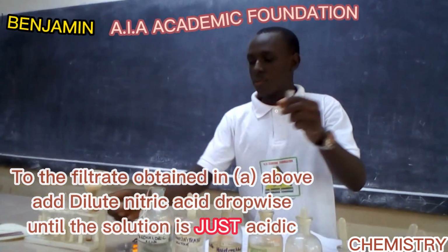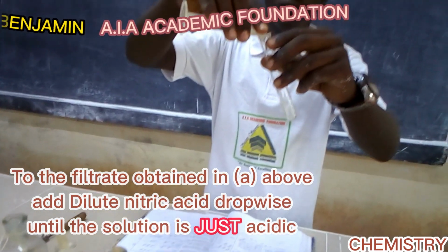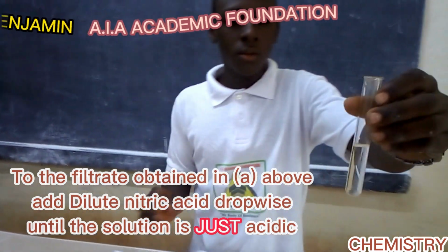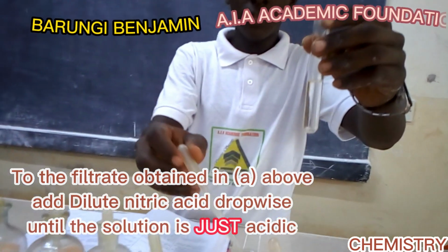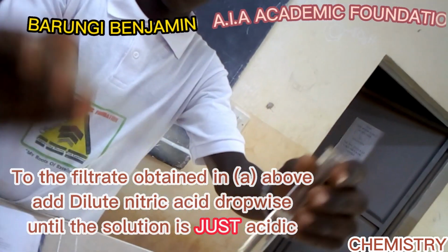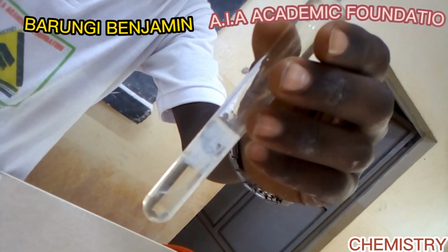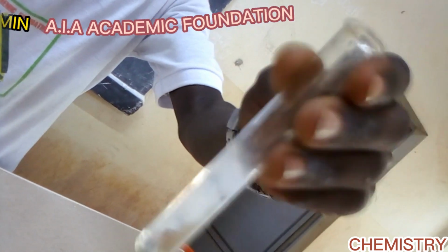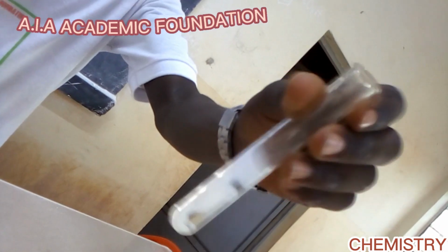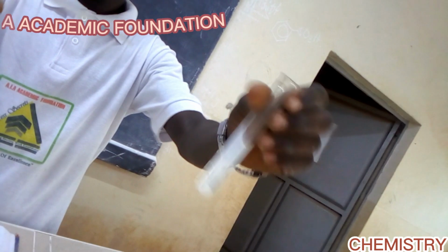I think we shall transfer our filtrate into a clean test tube. So this is our filtrate. We are going to add dilute nitric acid drop by drop until the solution is just acidic. As you can see, when we add drops of dilute nitric acid, we are getting white precipitates.